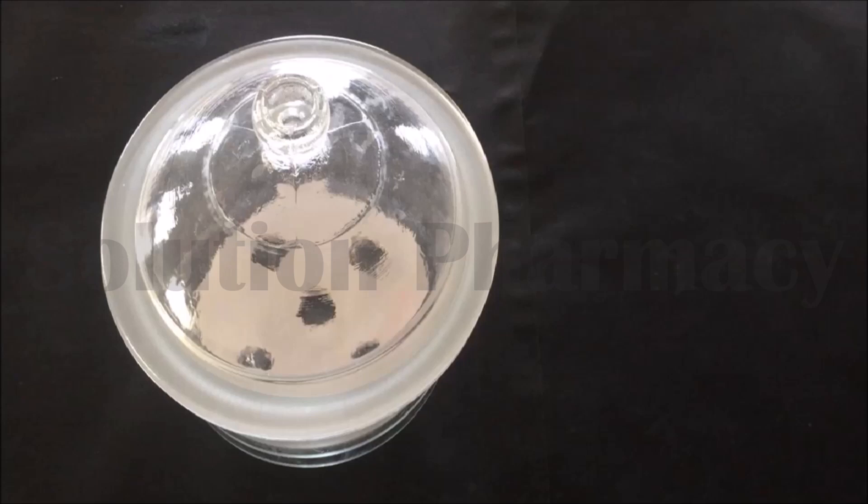Inside the chamber of desiccator we place a substance which is a drying agent and it is called desiccant. Desiccants are substances which work by a process called absorption and adsorption. This substance has an ability to attract or have particular affinity for water and have a strong affinity to absorb water. These desiccants remove water vapor from the desiccator atmosphere and also from the substance placed in it.